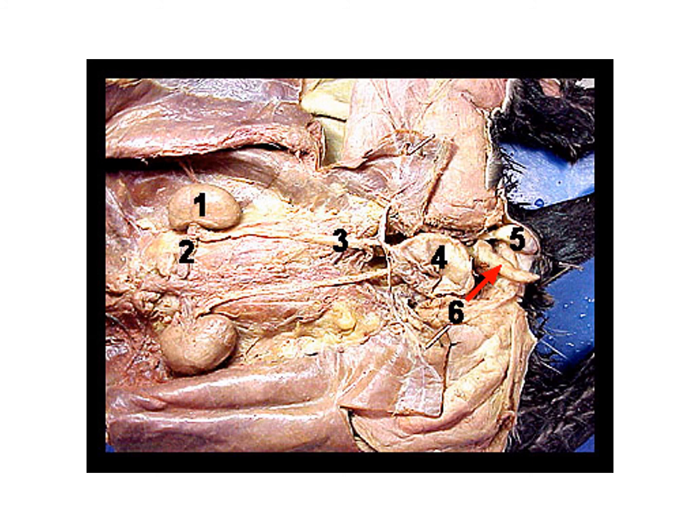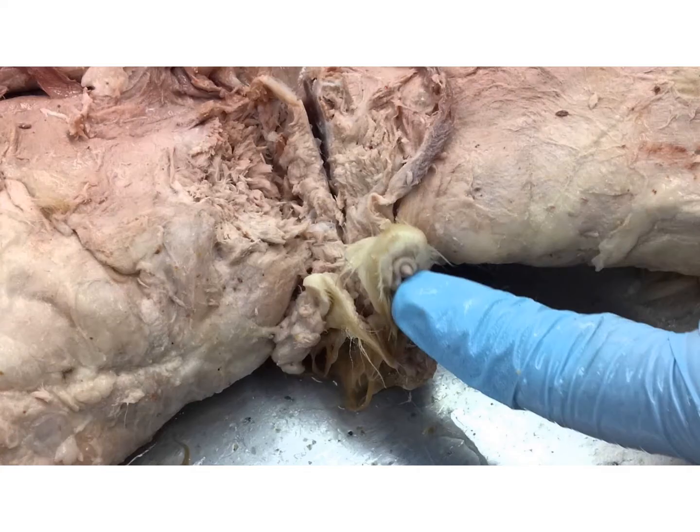Number 5 would be the cat's testis. And structure 6 would be the cat's penis. The penis has been removed from all the fur. I'll show you another picture in a moment where the fur has not been removed. Right there. So that would be the tip of the cat's penis.